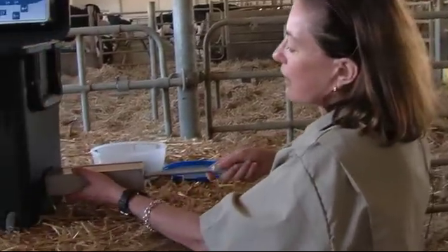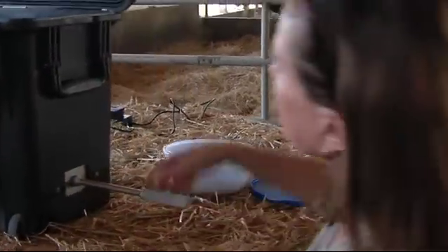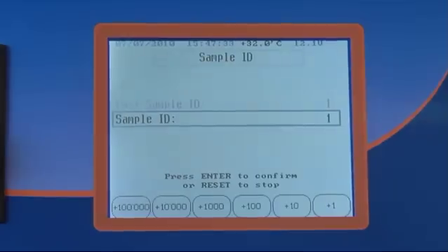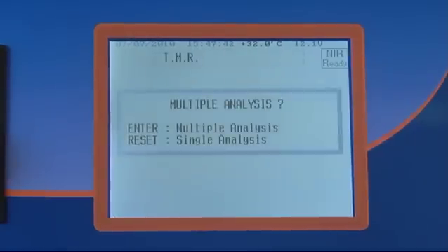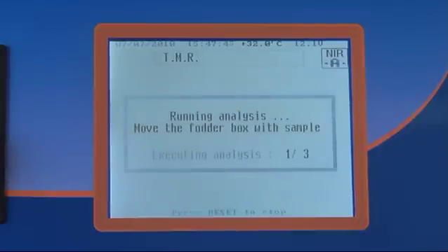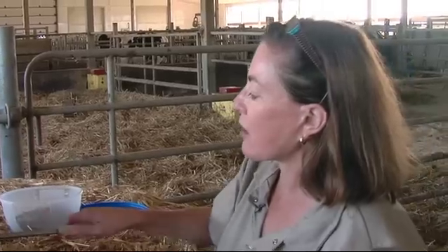I insert the rod into the NIR machine. I press Enter. It asks me for the ID on my product. I'm going to put it down to example number one, Enter, multiple analysis always, and then I start to pass it through the NIR eye.